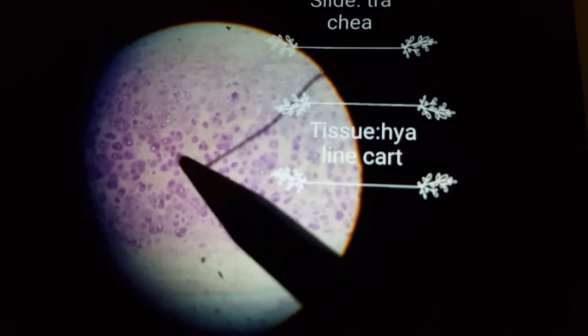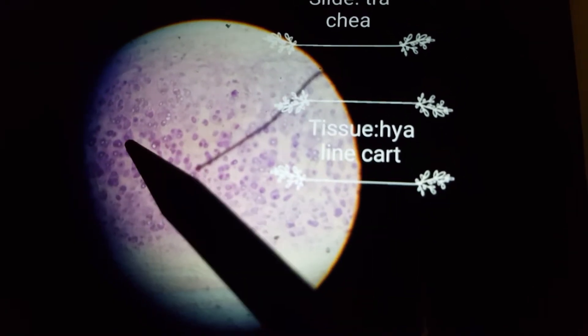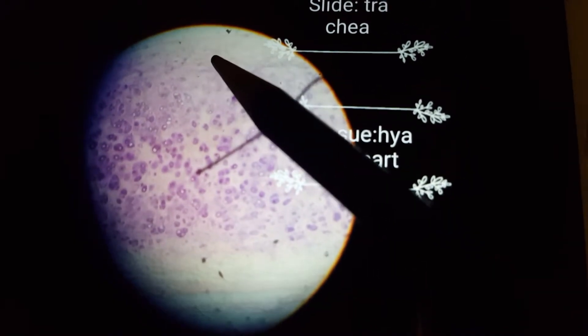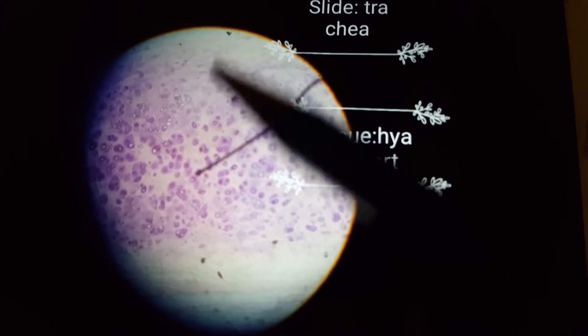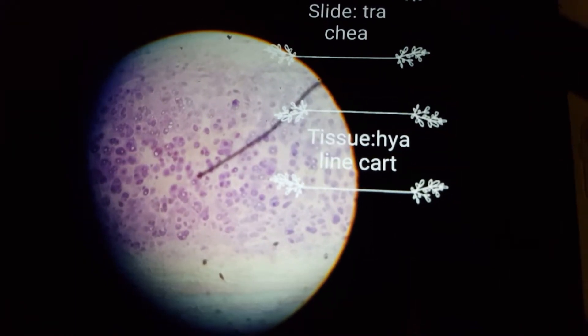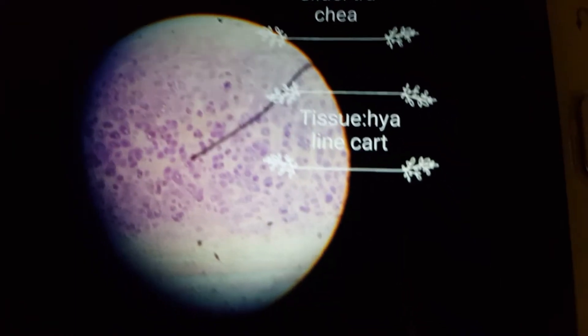In this next picture we can again clearly see this is hyaline cartilage because it has small lacunae and you can see the perichondrium. This is the characteristic cartilage of the trachea.